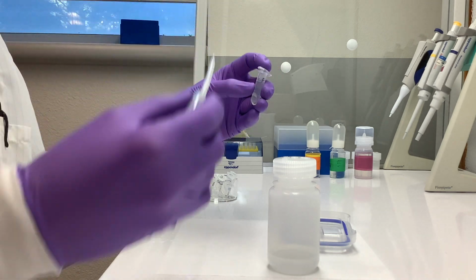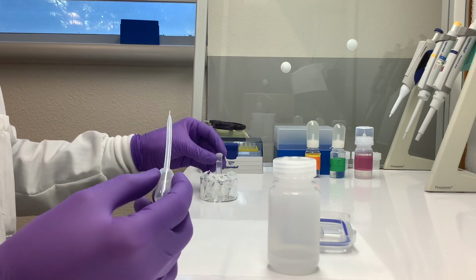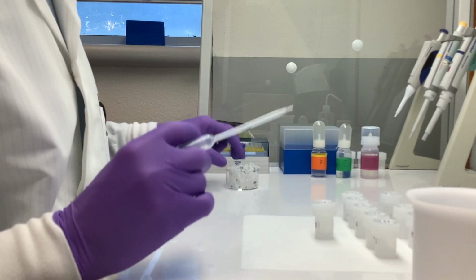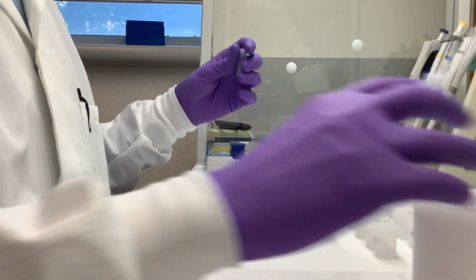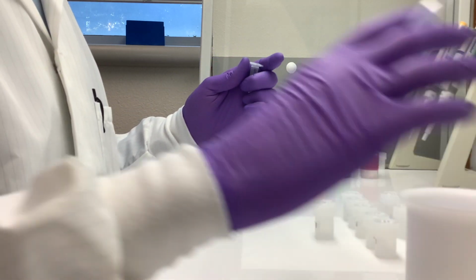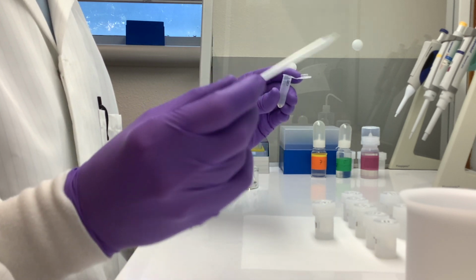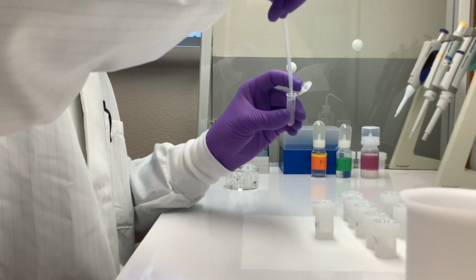Then, these vials containing the samples and the methanol are agitated at room temperature in an ultrasonic bath, which uses high-frequency sound waves to produce tiny bubbles that collapse with great force, effectively scrubbing the surface of our submerged material. After this, the methanol is pipetted out, and I rinse the remaining fractions several times with ultra-pure water to remove the methanol, dust, and anything else collected in this cleaning solution.